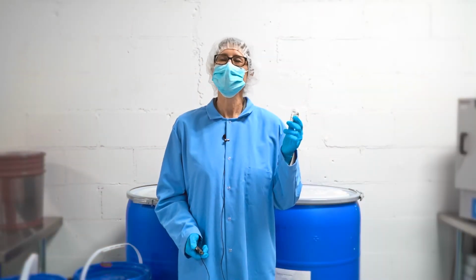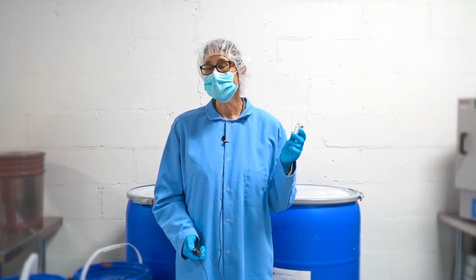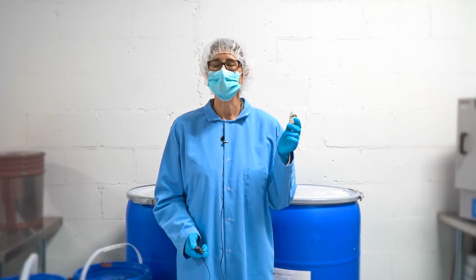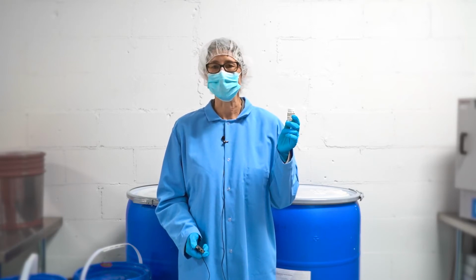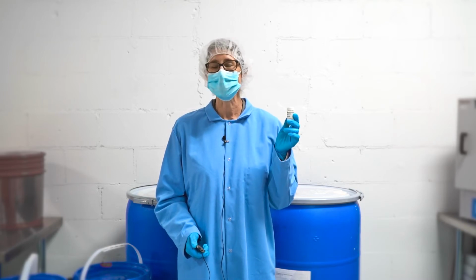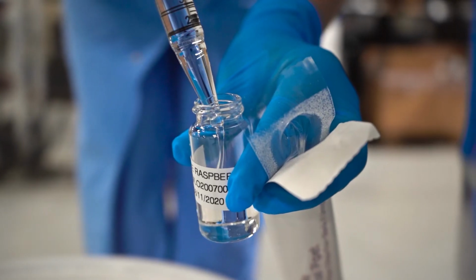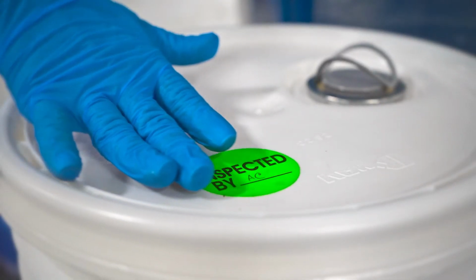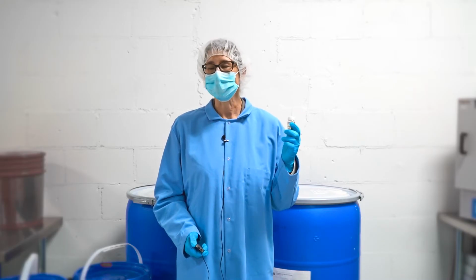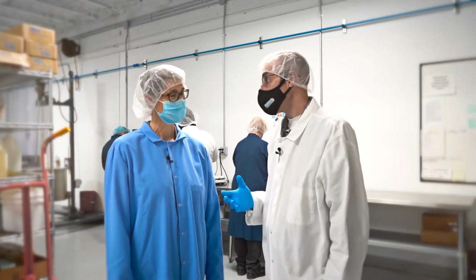So Joe just talked about we're going to follow an oil, day in the life of an oil. And where we start is always with our raw materials. Our raw materials have to be approved and released from quarantine. And that starts with first taking a sample. And then we bring the sample to the QC lab. They compare to our raw material specifications. And once it meets our raw material specifications, it's released from quarantine, and you know it's released by our green sticker. So we've got the verified raw ingredients and we're ready to make our CBD oils.